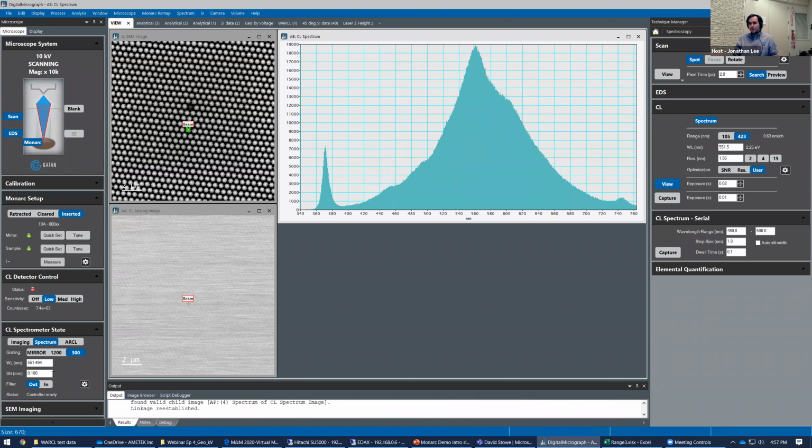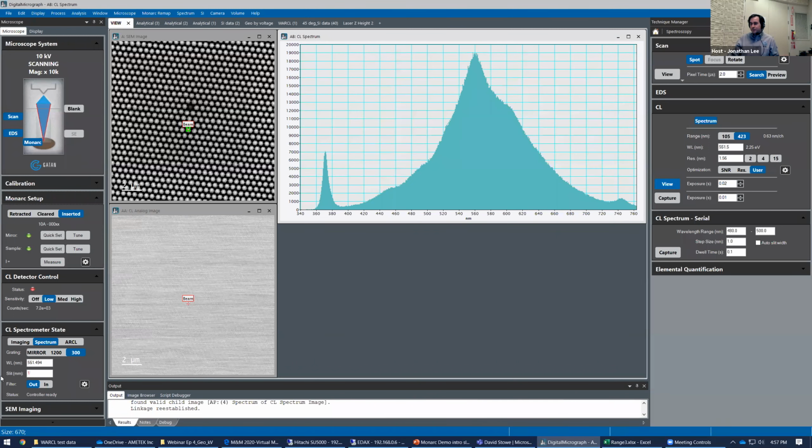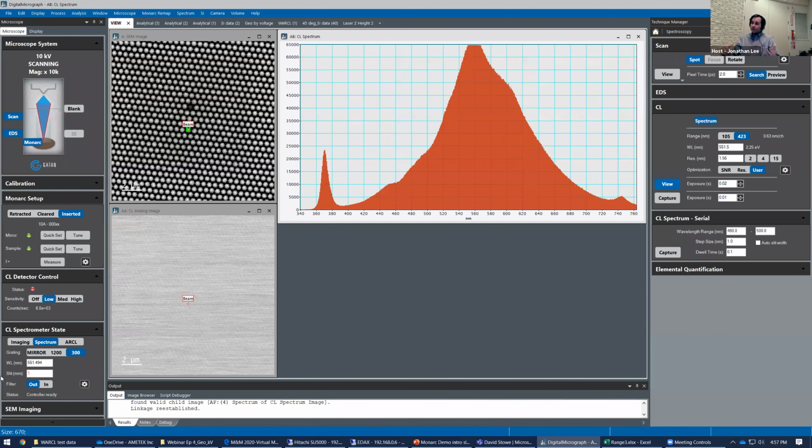Essentially what you would do is raise this up until you start to see different spectral activity, and then lower it down until you stop seeing your peaks shrink. Like this gallium nitride peak is something you could observe in that process, because it doesn't have any other spectral emission around it.